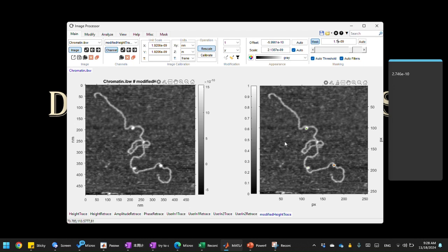After we have the proteins masked, we don't need the whole proteins to be masked. We only need part of it to be masked because we are only using the mask as a reference point to make our boxes, right? So we need to expand this mask later on to make those boxes.